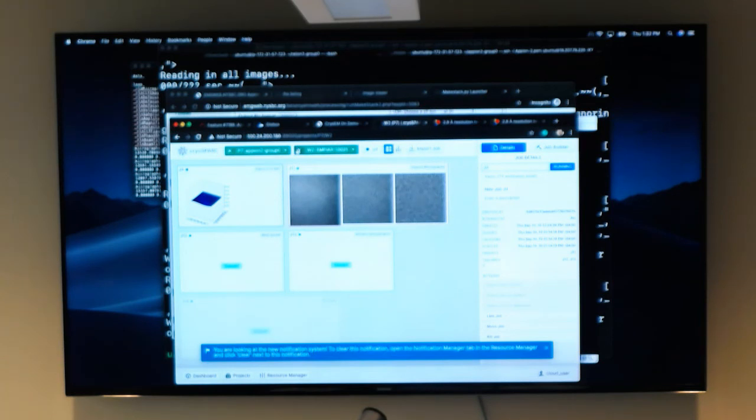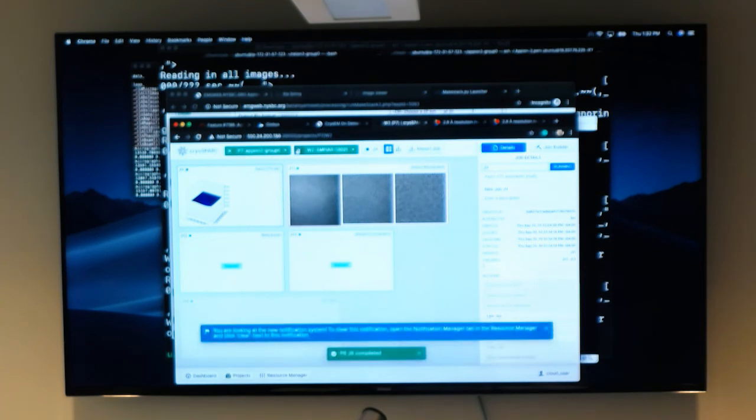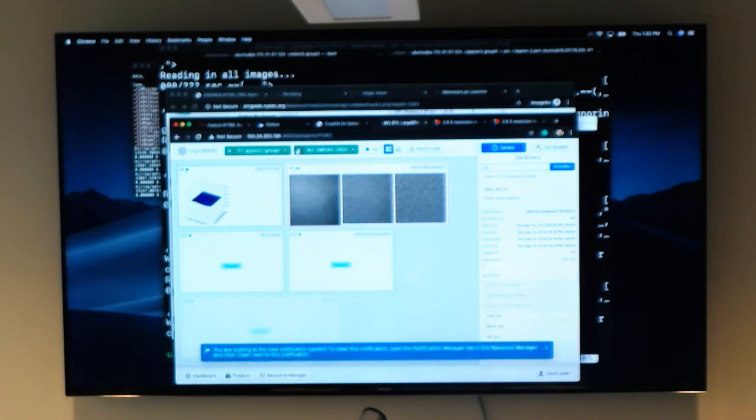Yeah. But ideally, if it's uniform, it would cover everything, like that and like that. Yes, but flat. Flat, yeah. Right. I think of it more like this, because if I have an orientation, intuitively I can see that. But then now you try to represent it in 2D. That's what it is.